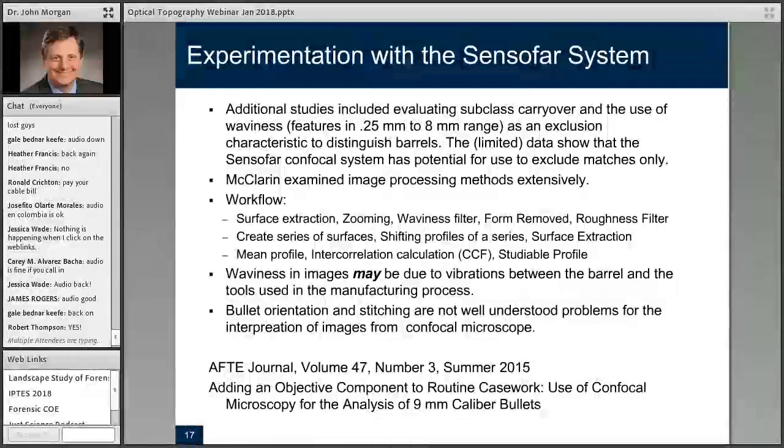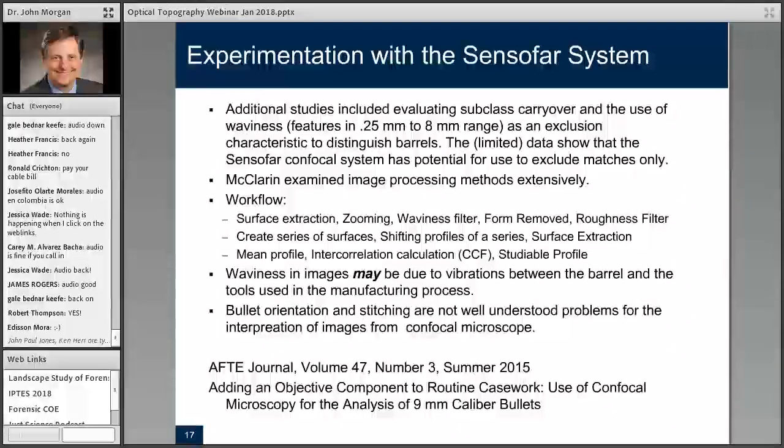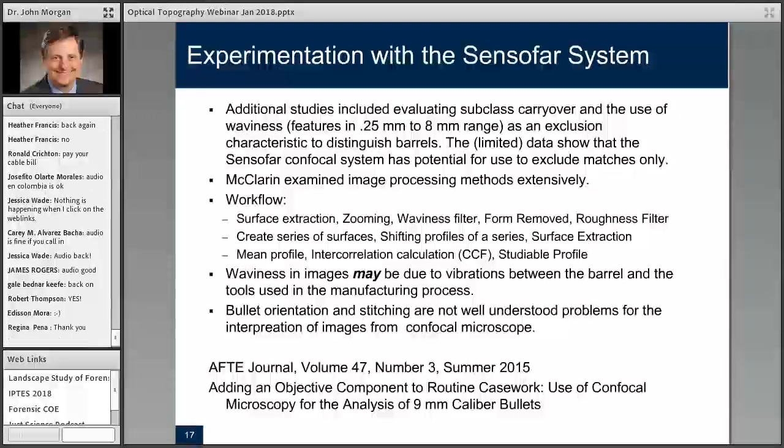Derek talked an awful lot about different ways of analyzing this data. And you see the list under workflow here. There's like 8 or 9 different ways that he processed the data. And one of the things that's an outcome here that you should keep in mind is very similar to the score idea. And that is, every time you process data, you're losing information.